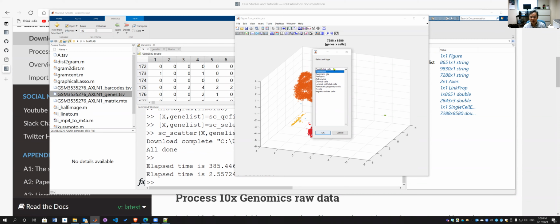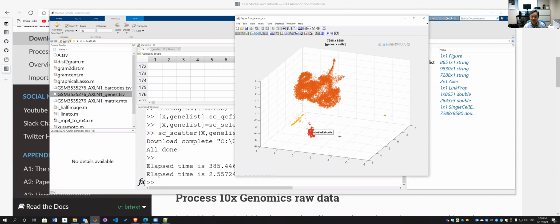So on the list, the top one, endothelium cell, the second is the fibroblast. The third one, just some names, Bergman glial. So definitely not the Bergman glial, not the astrocytes. So the first guess, we have this endothelium cell, could be the correct one. So I just select this, okay.